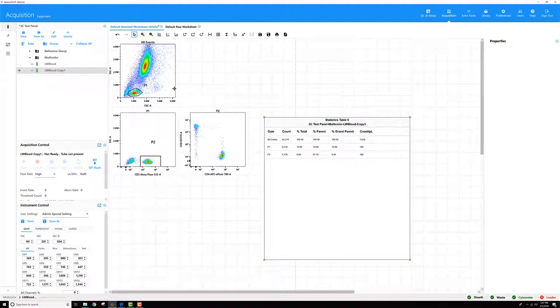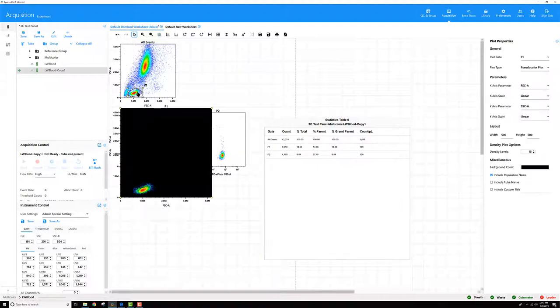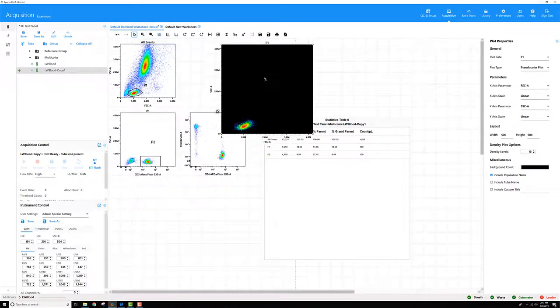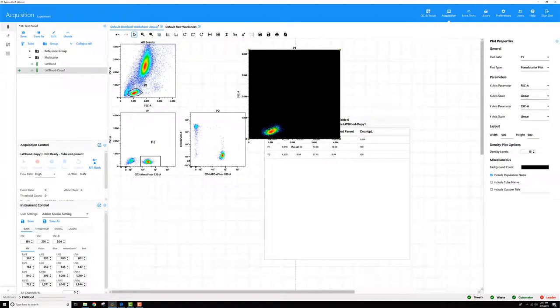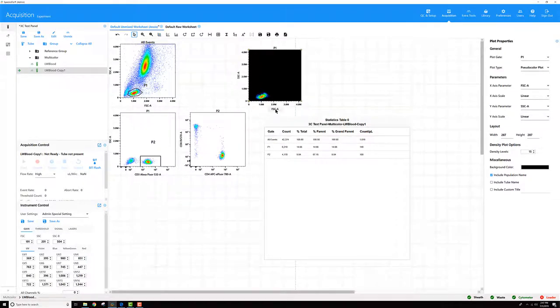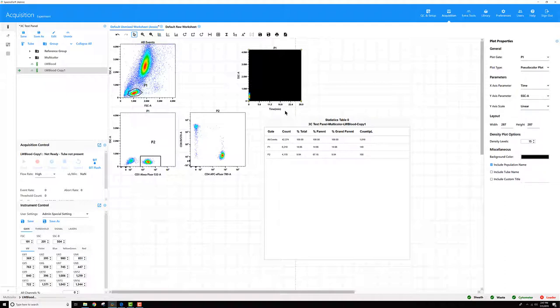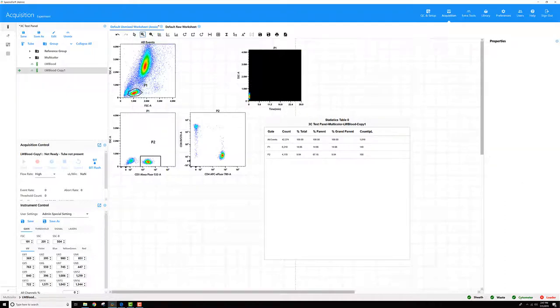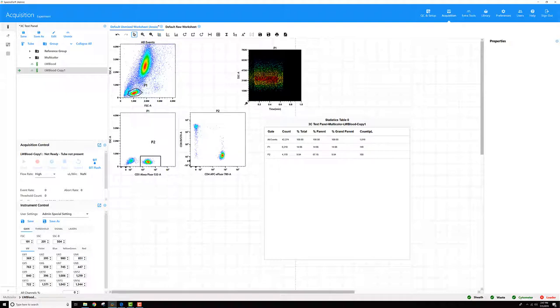Things to watch out for when you're doing volumetric counting. You should always check the time parameter for each tube. Let me go ahead and make one of time versus side scatter off of my lymphocytes. Let me zoom in on this plot here.